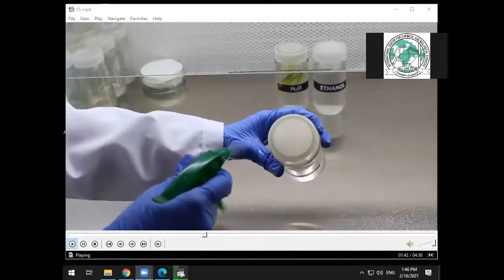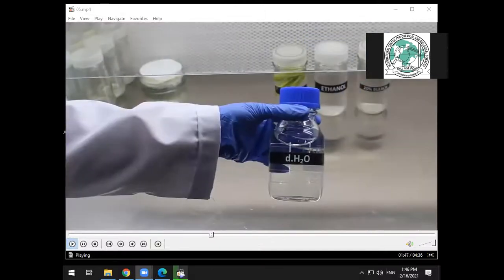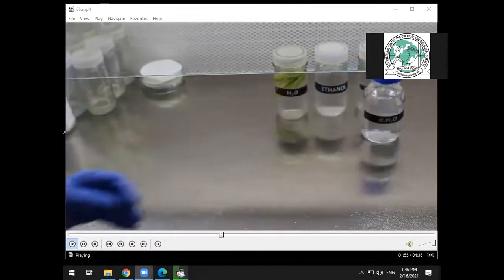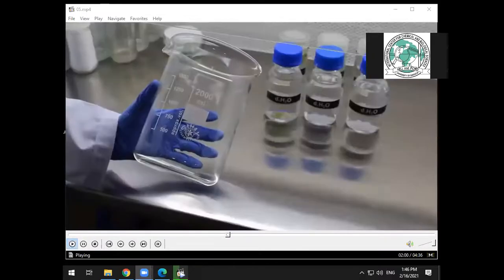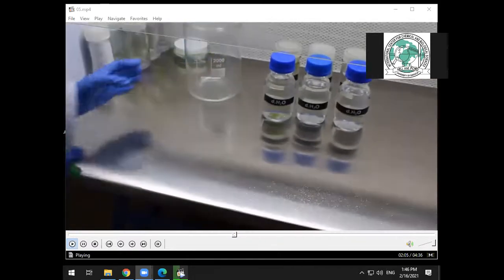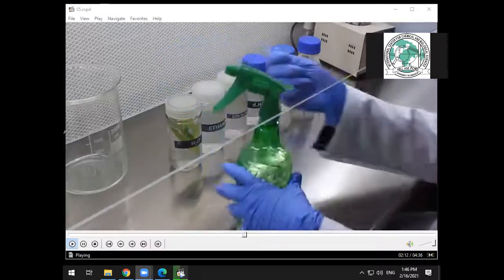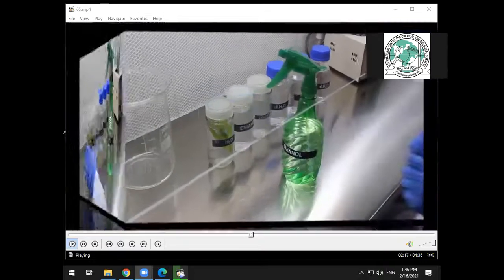20% bleach, autoclaved distilled water, discarder. Arrange objects in a way so that there is enough work area for the transferring process, and spray your hands with 70% ethanol before starting your experiment.